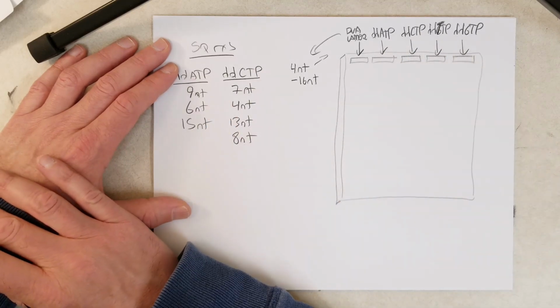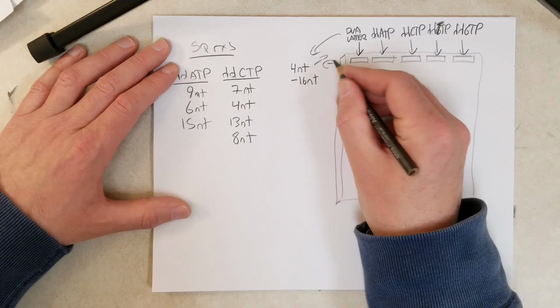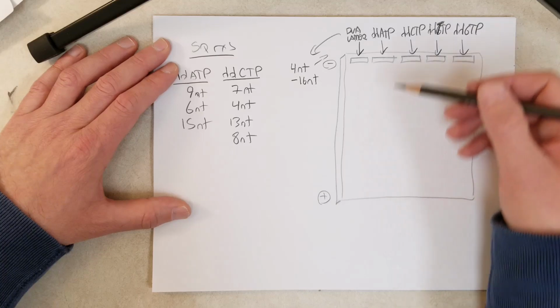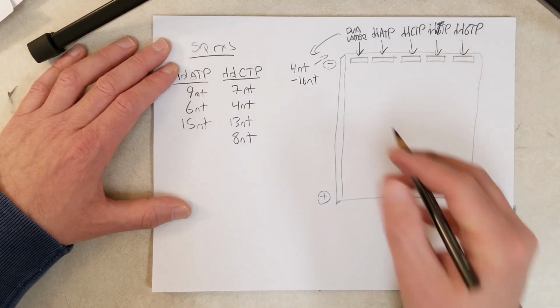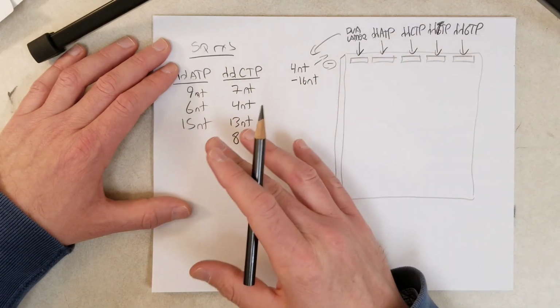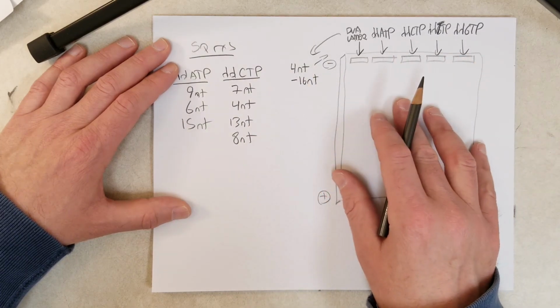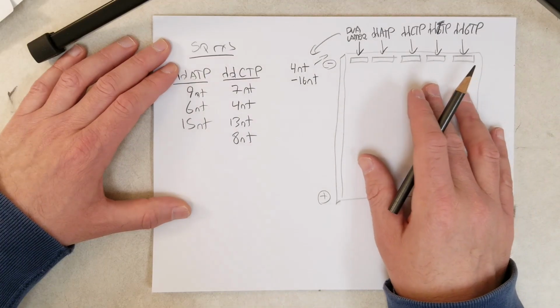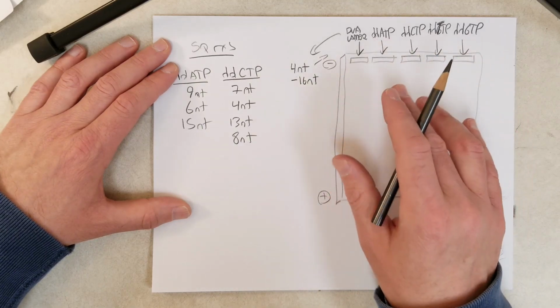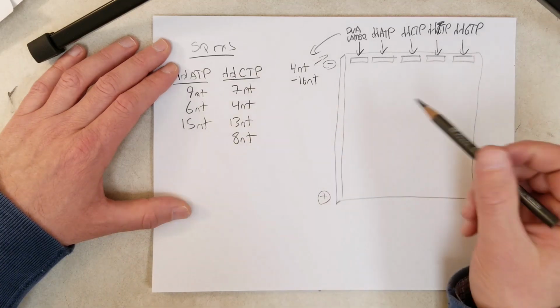So, okay, we're going to load all our DNA samples into these wells, and this is floating in a buffer, and the DNA molecules are going to migrate through the gel here. Once they migrate through, we can see where the DNA is in here. We don't need to worry exactly about how that process works. We have dyes we can stain the DNA with. You could use radioactive nucleotides in this process, and detect the position of the DNA based on where the radioactive molecules are. There are a number of different ways you can do that.